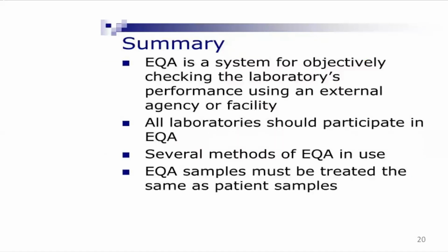Ultimately, EQAS is a system for objectively checking the laboratory performance using an external agency or facility. So there is objectivity. Subjectivity means everything is in your hand. You find something not acceptable, you modify that. But in this, objectively, you are submitting your result. You don't know whether the result you will get will be within the acceptable limit or not. It is better that all laboratories participate in EQAS because this tells you about the accuracy. An EQAS sample must be treated the same as the patient sample.